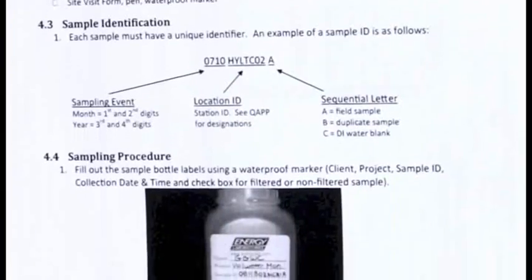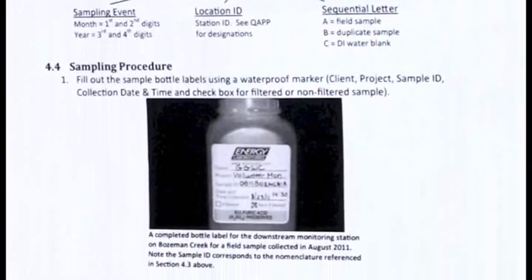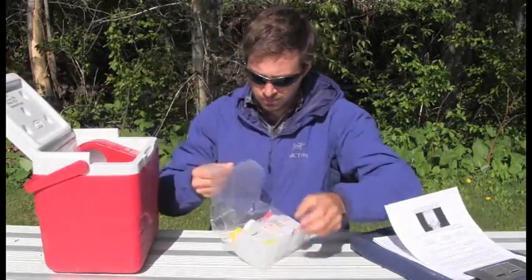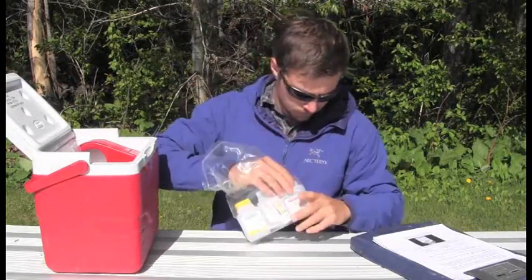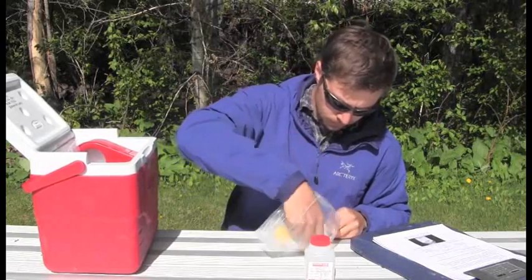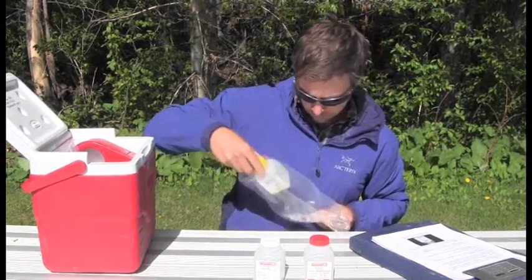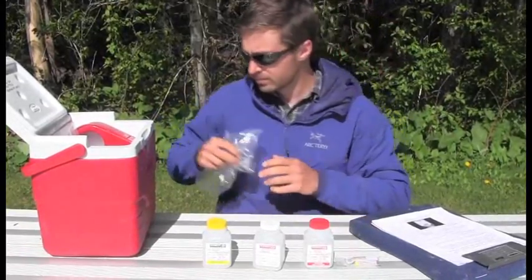Once you are familiar with the necessary protocols, unpack your cooler or equipment bin, and make sure you have all the appropriate materials needed to collect a sample. Here at our sample site, we will need to fill 3 bottles per sample, and we will need to collect duplicate and blank samples.